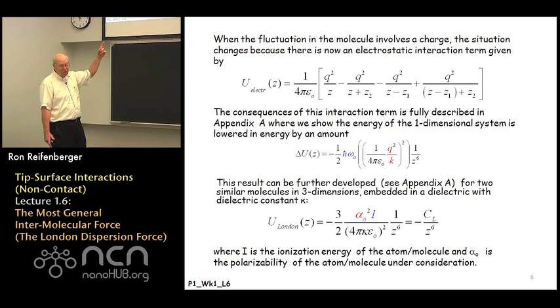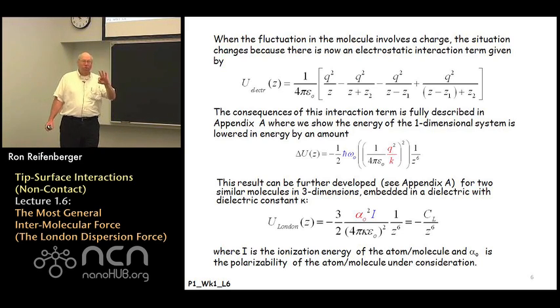middle of this slide. And it turns out that when the two springs are coupled one with respect to the other by this electrostatic coupling, the electrostatic potential energy of the entire system is lowered by an amount that's indicated in the middle equation here. There are actually three important features of this equation that should be noted. The first is there's an overall negative sign. That means it's an attractive interaction.